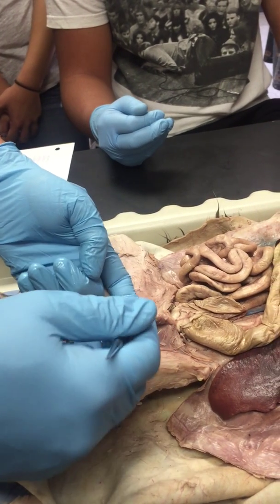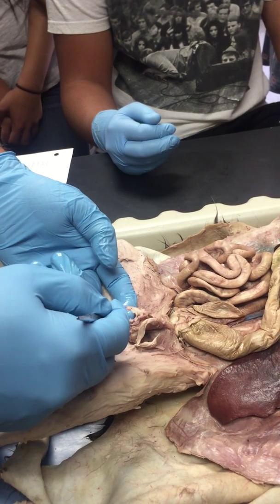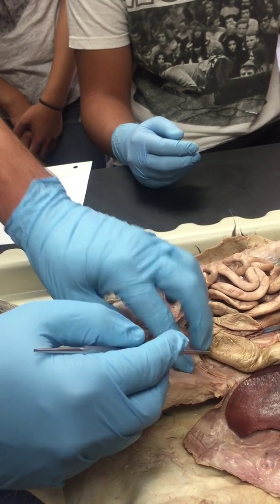What they'll do is they'll cut this tube. They actually do it in the scrotum. They'll cut it here and cut it here. But again, in a man, they do it in the scrotum. And then they cauterize each end, so there's actually a little space in between.